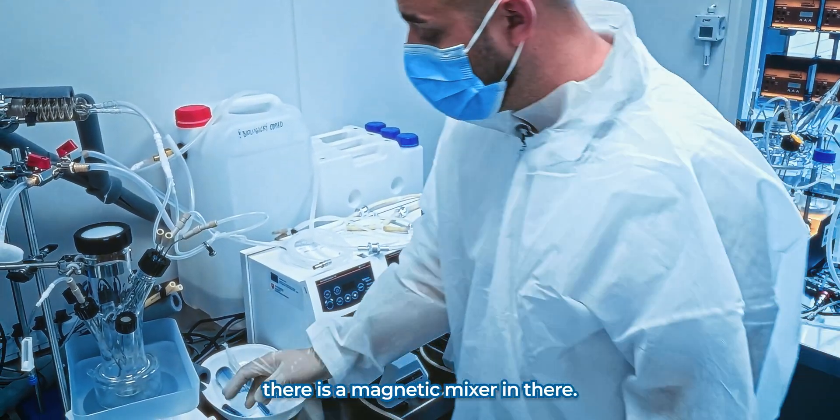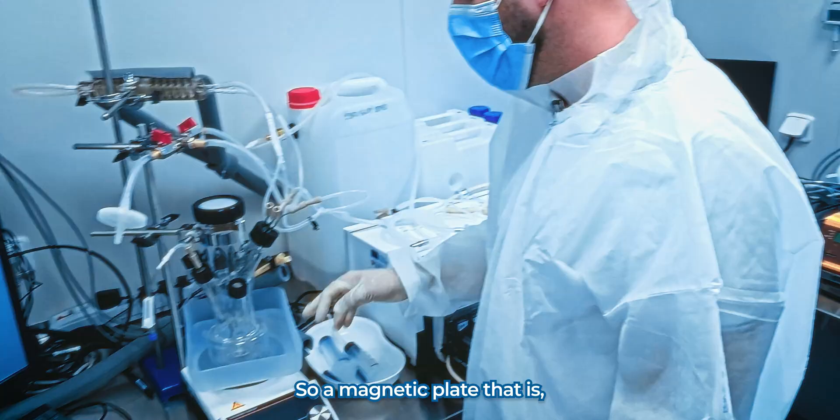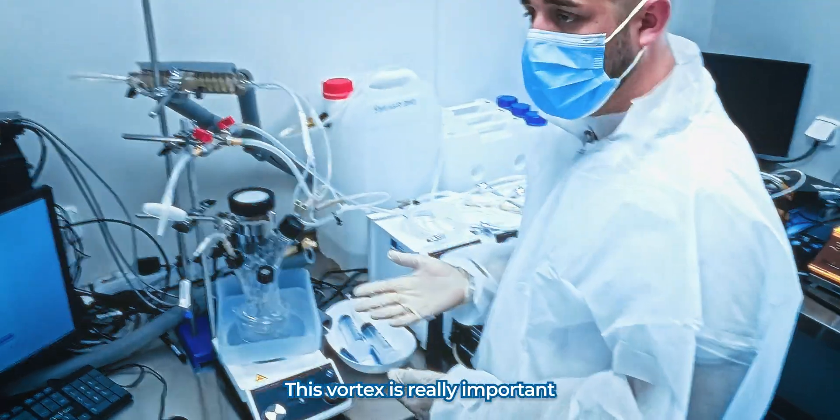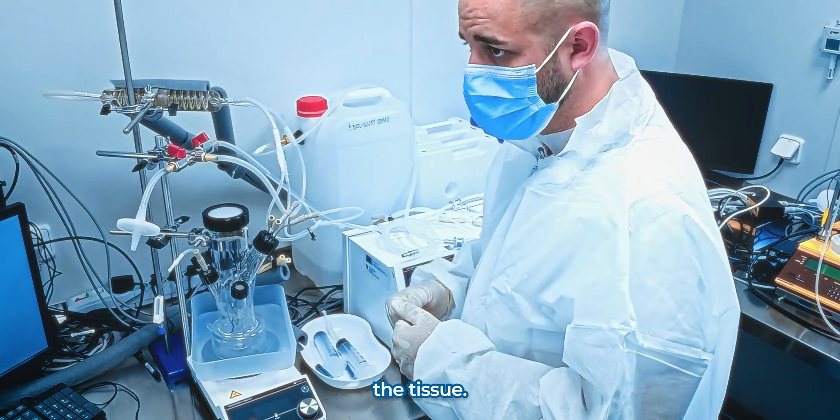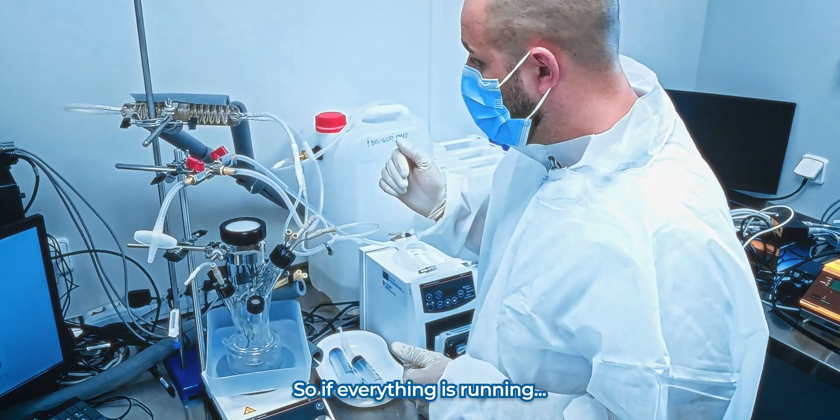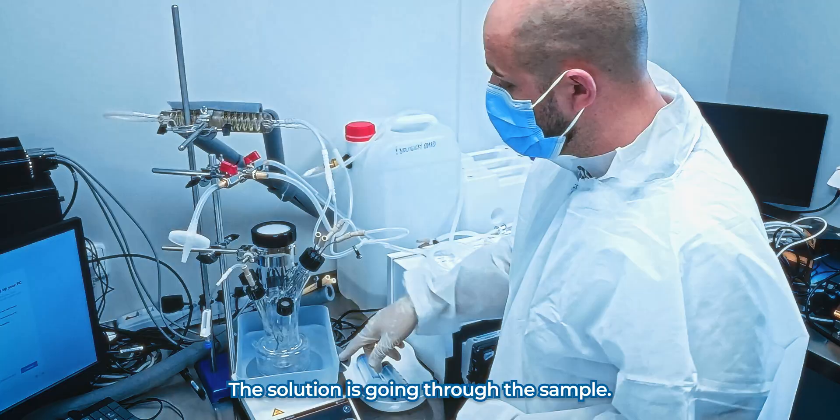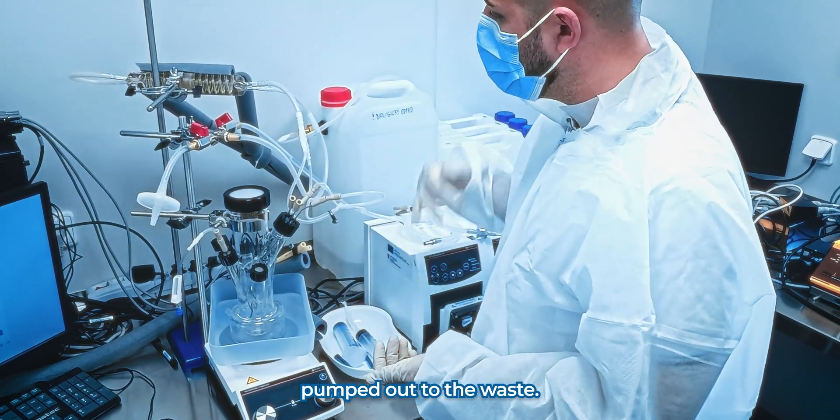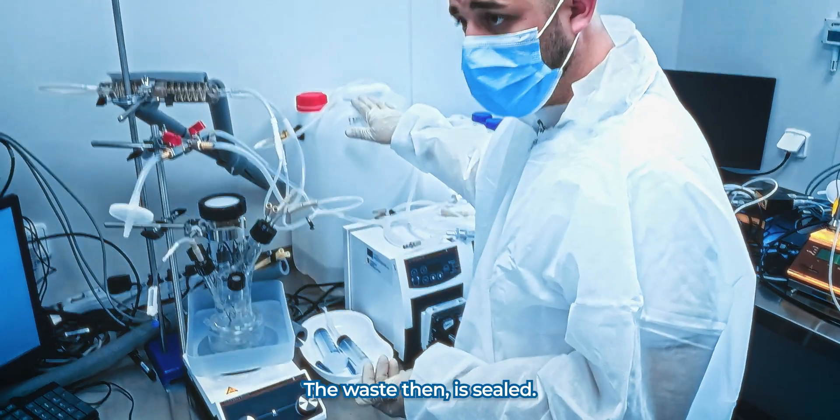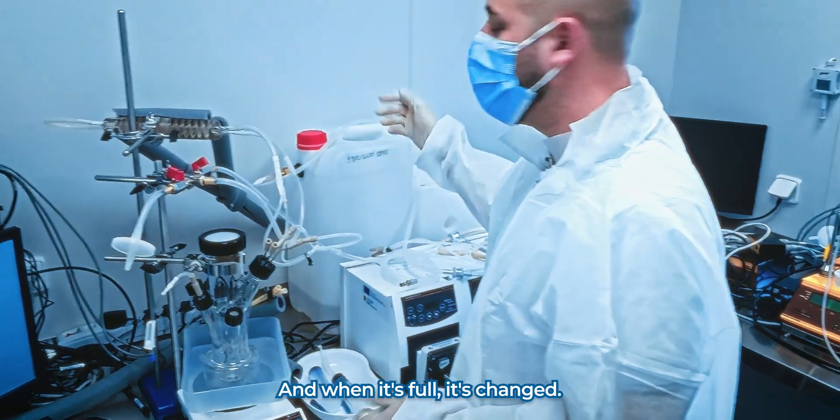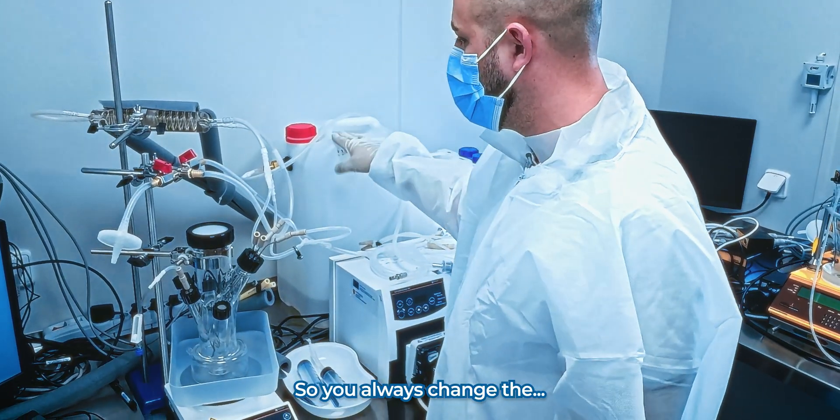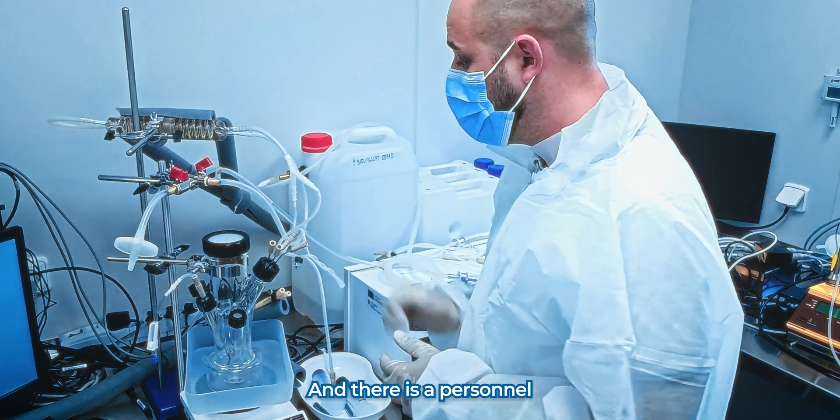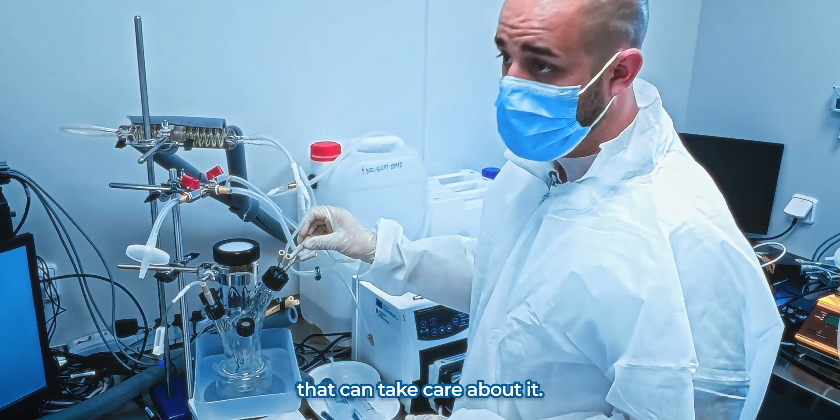What's helping is that there is a magnetic mixer under it, so a magnetic plate that is helping to create some vortex inside, because it is really important to really push the solution against the tissue. So everything is running, the solution is going through, through the sample, and then all the debris and everything is pumped out, pumped into the waste. The waste then is sealed, and when it's full, it's changed. So you always change the... And that's your biomedical waste. Yeah, that's the biomedical waste. So you're going to take it out, and there is personnel that can take care about it.